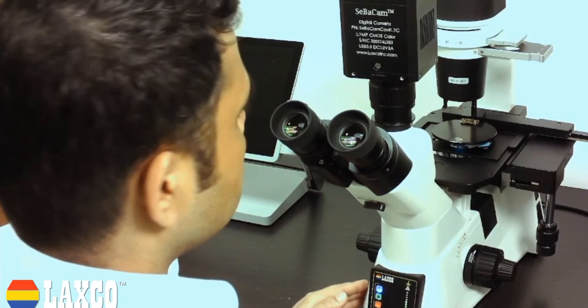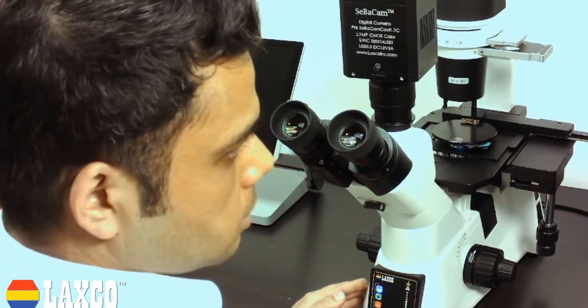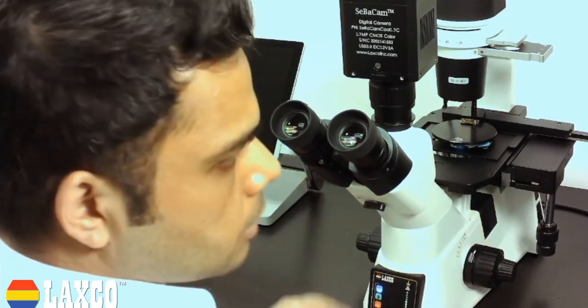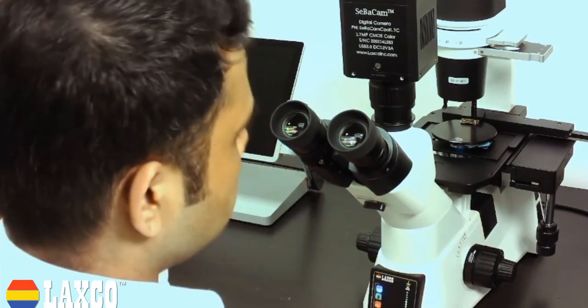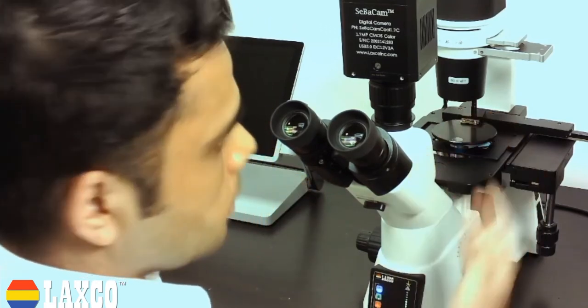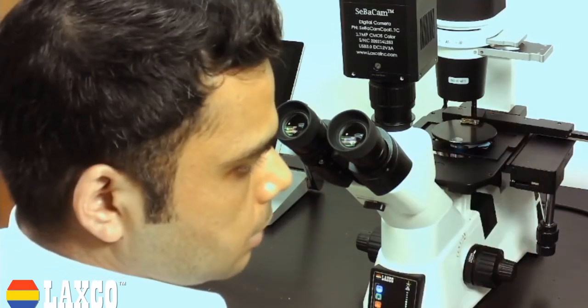And this is also a trinox system. So as you can see, you can attach a camera here.